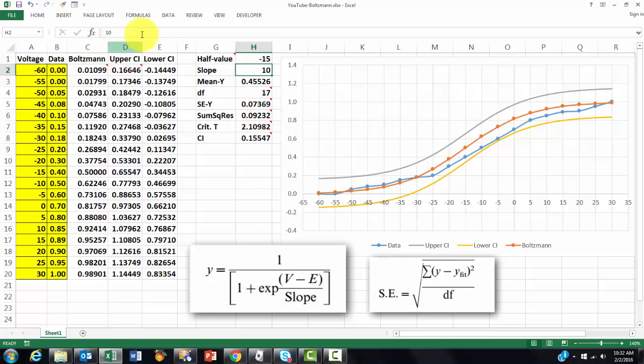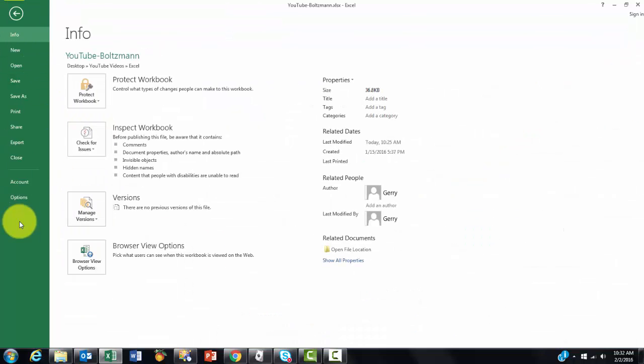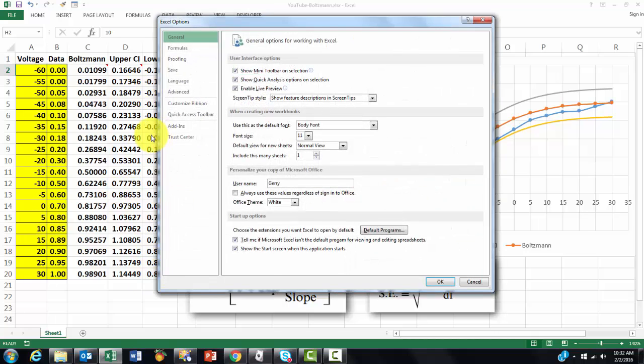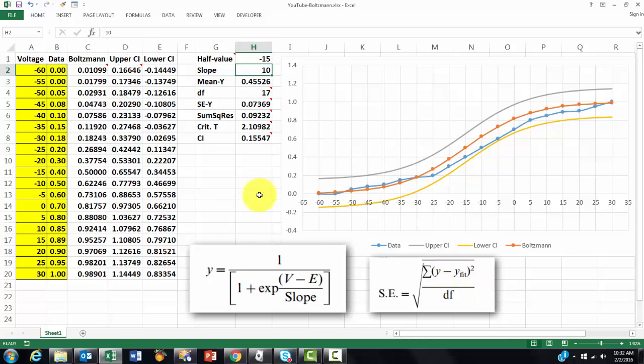So what we do need is, we need from data, solver. If you don't have solver activated yet, you do have it, but you may not have it activated, then you go to add-ins, and you add that one by go to, and you find an add-in that you want. So you need not only the analysis toolpak, but also the solver add-in.